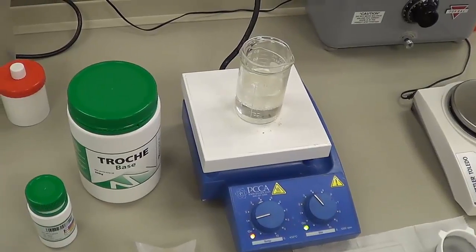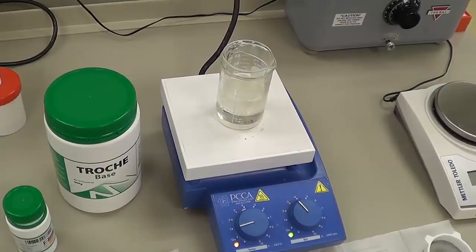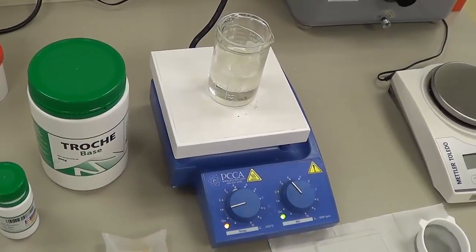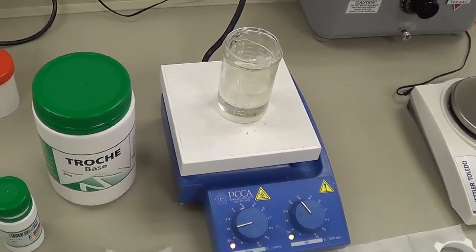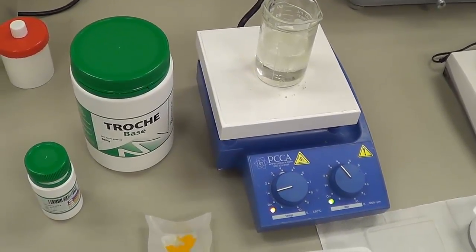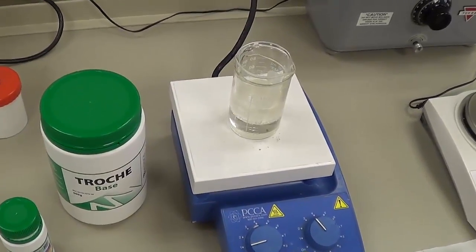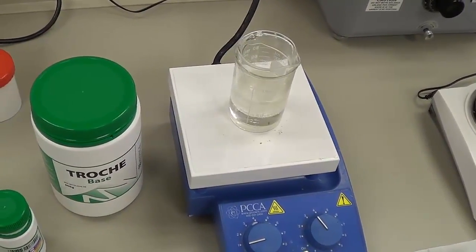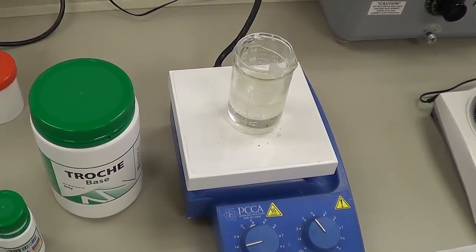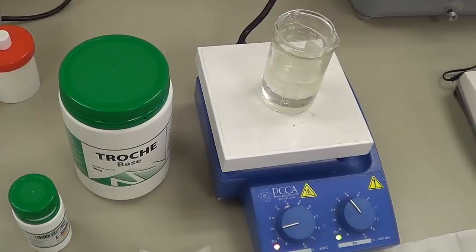Welcome back. Today I'm going to show you the preparation of lozenges or troches. These are nothing but similar to the hard candies which you may have tasted earlier in your childhood. Basically, these are solid or semi-solid preparations that are designed to dissolve the drug slowly in the mouth, so the drug is absorbed in your buccal cavity region, either for localized effects.